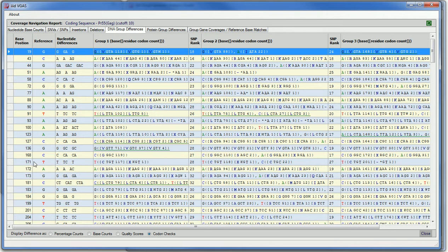So position 171 for group 2 we have TC, where the T we have 2 codon possibilities where the third nucleotide base is the T in the codon, so TGT, KGT. This makes a C or an X amino acid, or we have a C where we have TGC which again just makes a C.